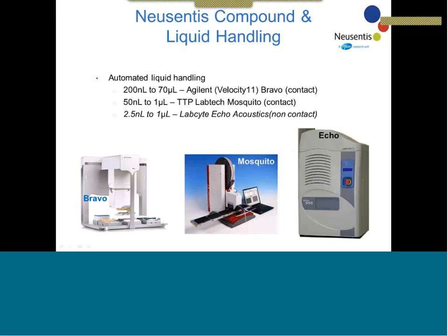Or alternatively, you can even fill the IonFlux HD plates with about 10 microliters of buffer, put those into the acoustic echo dispenser, and get your DMSO stock compound dispensed directly into the IonFlux plate that way. And again, dilute with ECS just before the assay, and you're good to go. So all of this has enabled us to really increase the throughput and make life easier for screening on the IonFlux.